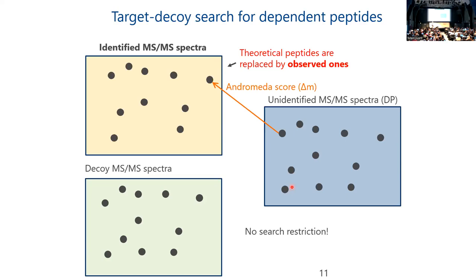That's also a good question. So there is a gain, though it might not be as big as you would expect. If you're looking for occurrences other than tryptic, semi-tryptic, then you need dependent peptides. So if you're interested in cleavages of 10 different proteases, then you turn on the dependent peptide search. Obviously, if you're looking mostly at tryptic ones, you should vary this parameter. Thank you.